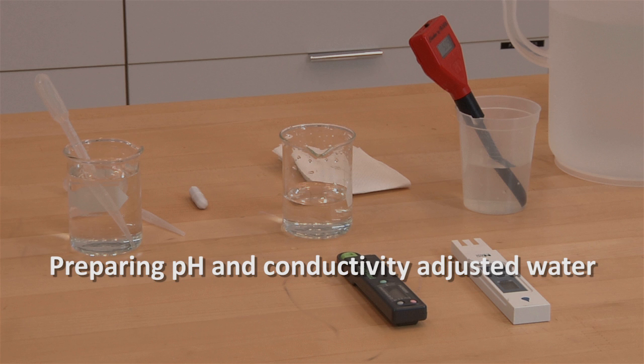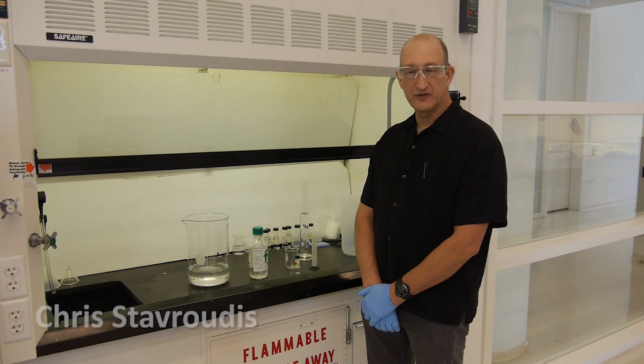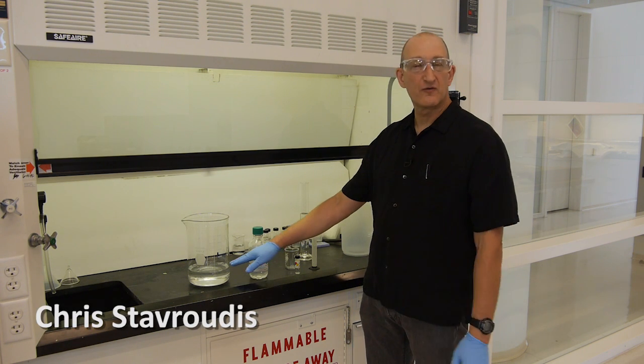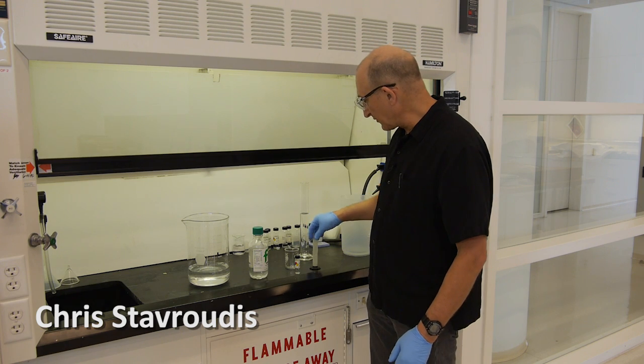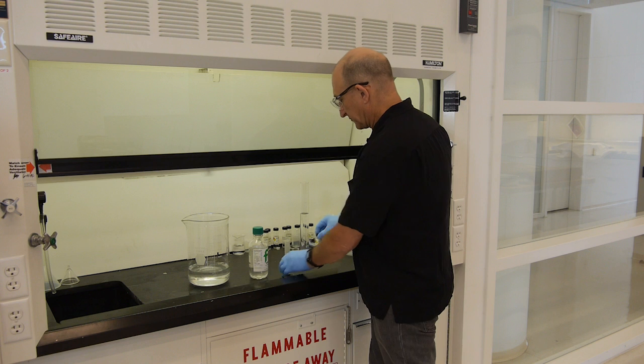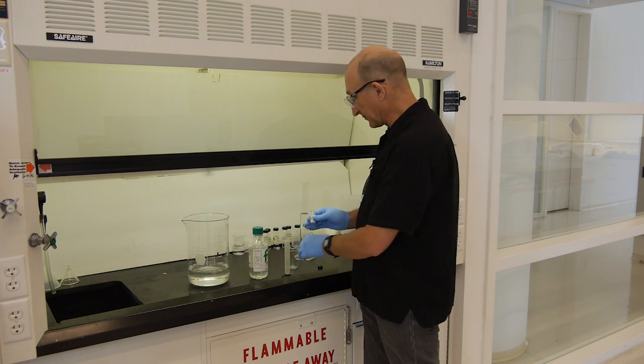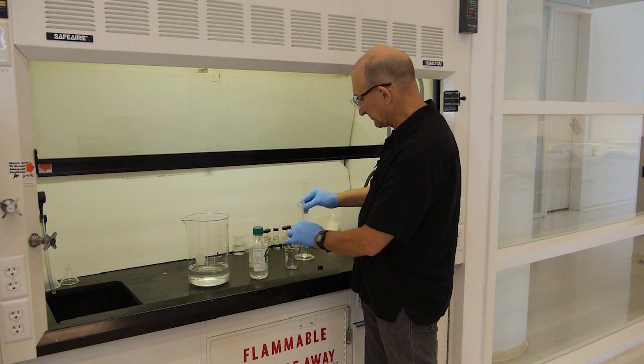To make the pH adjusted water, we're going to add 10 milliliters of glacial acetic acid to a liter of water. We want to do this in the fume hood or outdoors because it's pretty stinky. We also want to wear proper protective equipment when handling the concentrated acids and bases.